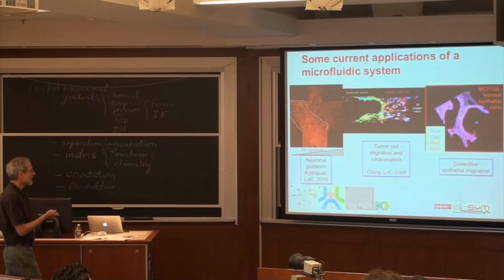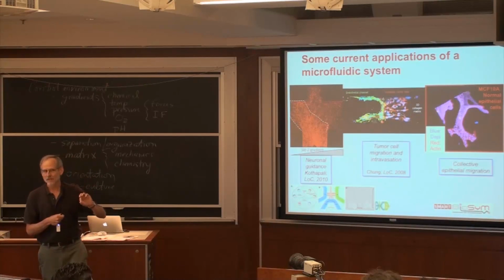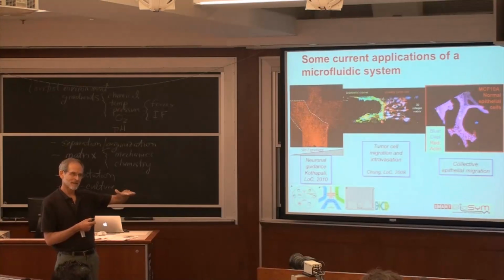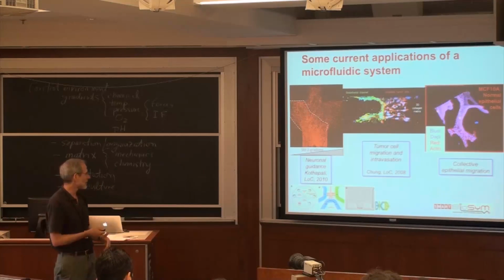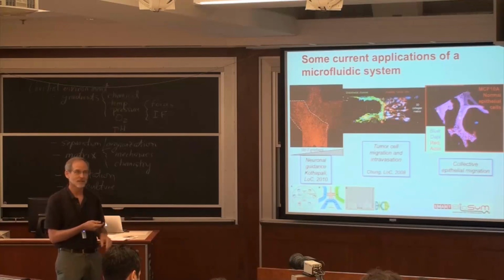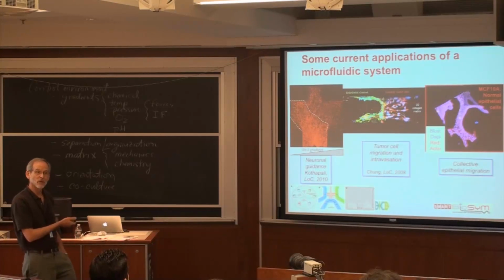Here we are looking at axon guidance. There's a lot of interest, in terms of spinal cord repair, to get the neurons, the end of the neurons on one side, to grow across a region of damaged tissue and connect with the neurons down here. So you're interested in identifying what the chemoattractants are that actually guide the axons. Well, in this case, what we've done is we've used a known chemoattractant, SLIT2. This actually tends to be a chemorepellent.